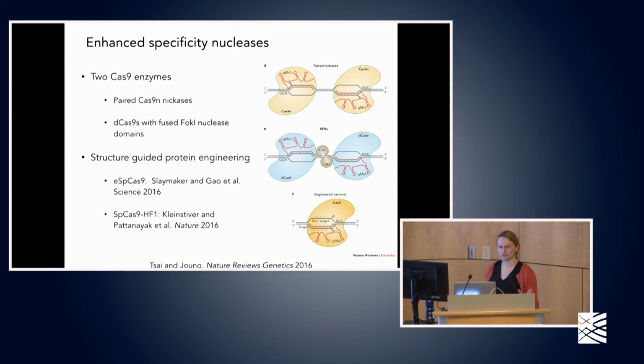They have different mutations, but ultimately the amino acid mutations interact with the targeting regions, or close to the targeting regions, of your guide RNA, and therefore these papers have illustrated that there is higher specificity. So you have clean on-target cutting and reduced or eliminated off-target.